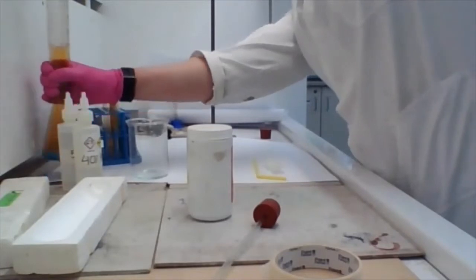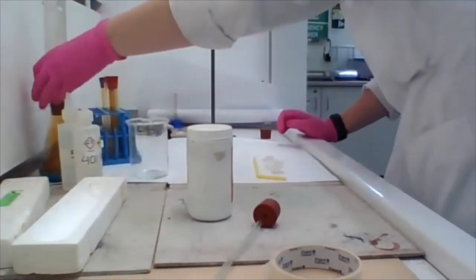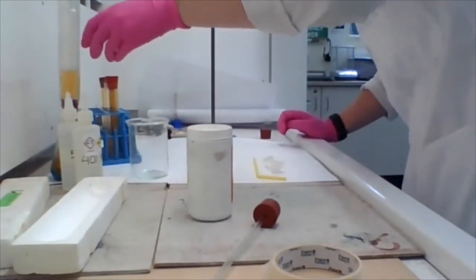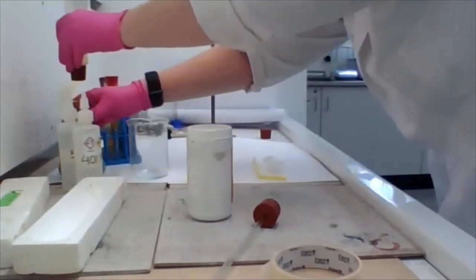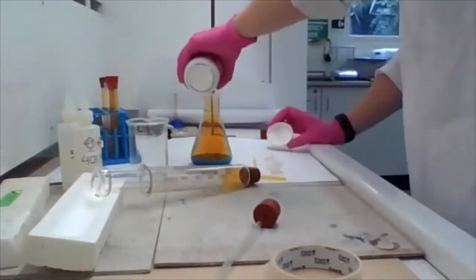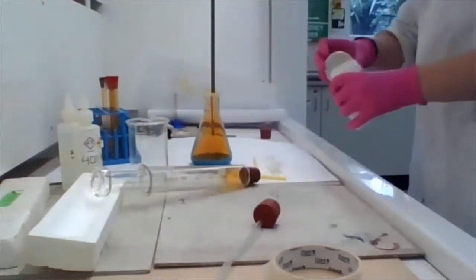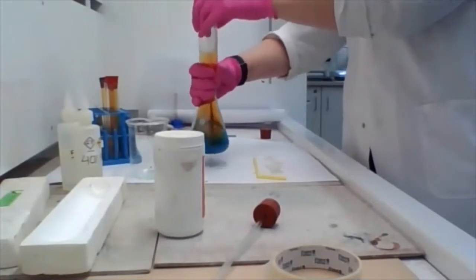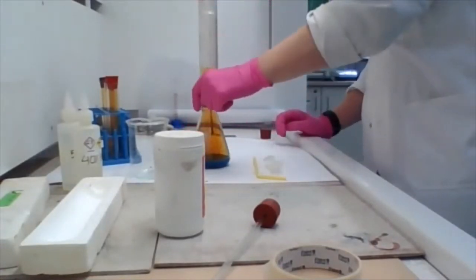So I'm just filling up my gas syringe, and of course that reaction is now no longer energetic enough to just be pumping gas in. So what I ended up doing was I ended up topping up a little bit of copper, and I think I also added a bit more nitric, but you'll see that in just a minute. And again, you see that lovely blue copper colour.